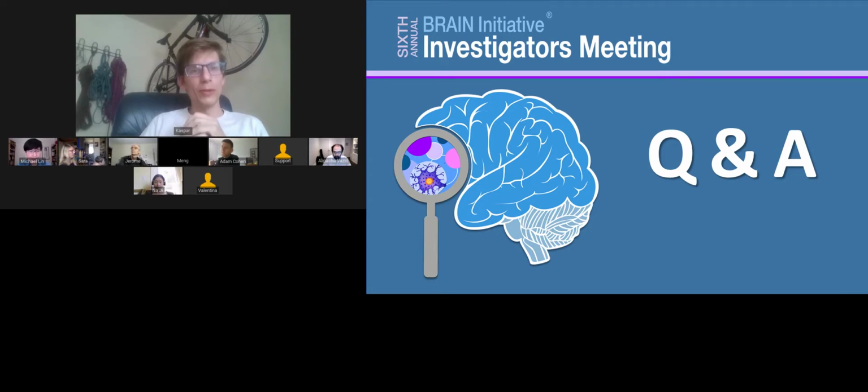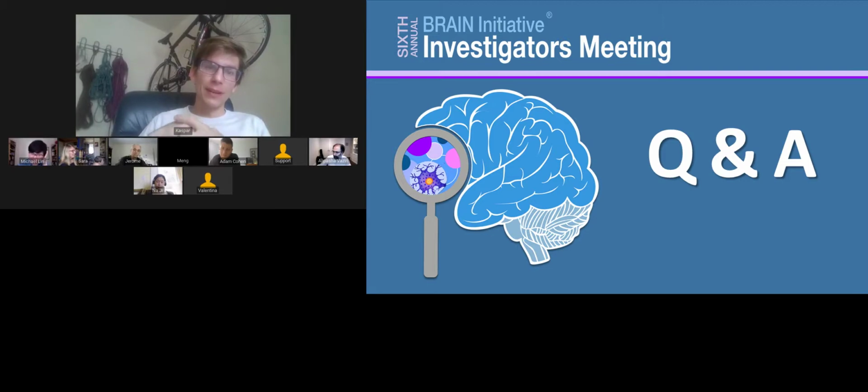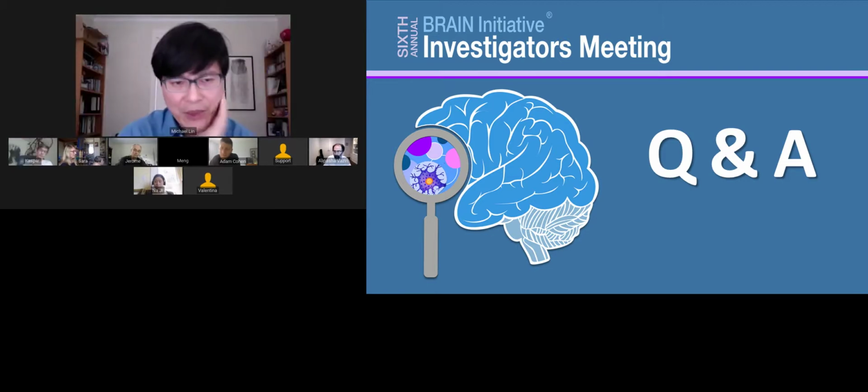Sorry, Michael, do you remember the second question? It was what if you compare GCaMP7 and iGluSnFR? And actually, before you answer that, we have a question from Doug Kim, who's one of the conference organizers. Hello, Doug. He wants to know if anyone should buy 1030 nanometer lasers and what color sensors and opsins everyone should make now. I guess the question is whether we should all try to convert to 1030. This is a super important discussion topic, I feel. I don't know. Yeah, that's right. So I don't think we have time to cover all those things, but if you can answer those questions briefly, that would be great.